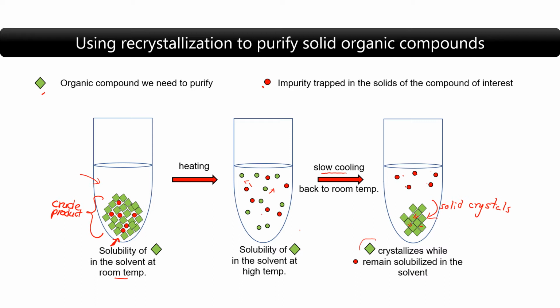Now we can either filter or centrifuge to separate these recrystallized solid crystals out of the solution. And now we will have the isolated pure product that we were interested in getting.